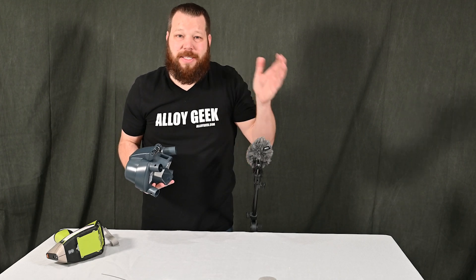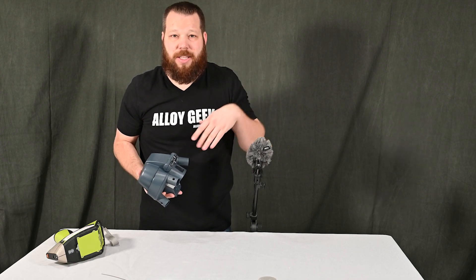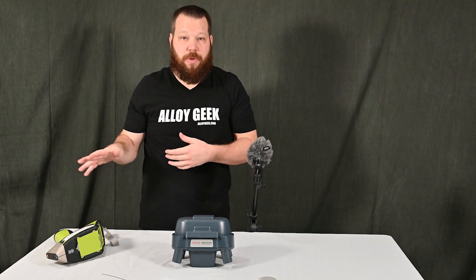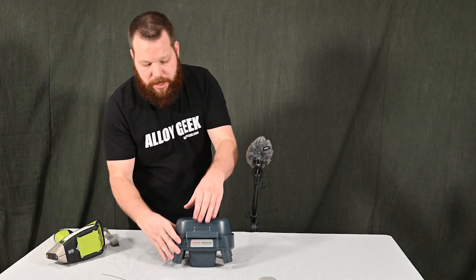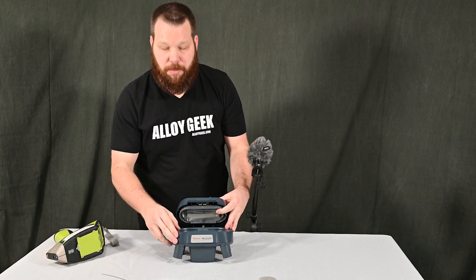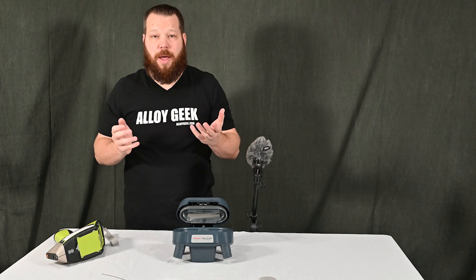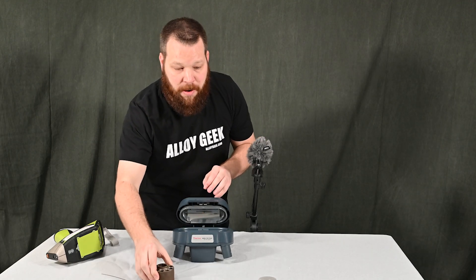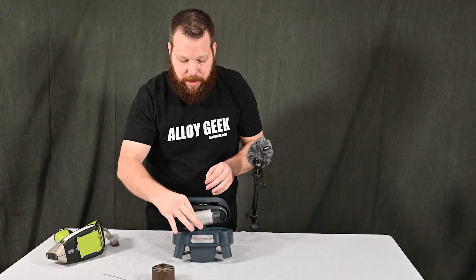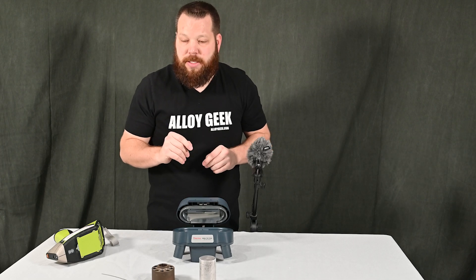This test stand is one of the less expensive options, but if it's a business expense and you're setting up a lab for a long time — for geology applications, for example — just get the desktop test stand. It's a much nicer feature. You don't have to worry about losing legs in the field, and they come with a carrying case. The little sample stage inside actually fits sample cups as well, so you can prepare sample cups and do your testing. Miners and mud loggers love this test stand for its portability, but big samples or bar stock from a foundry or mill will never fit in there satisfactorily.